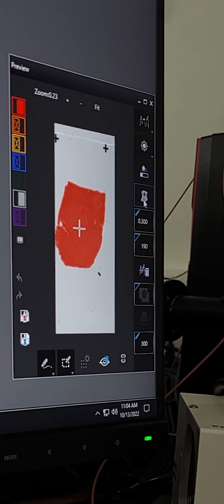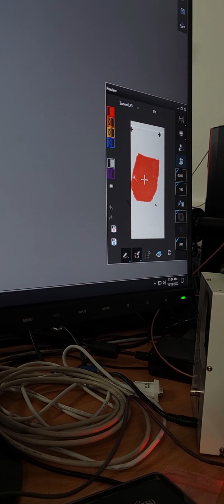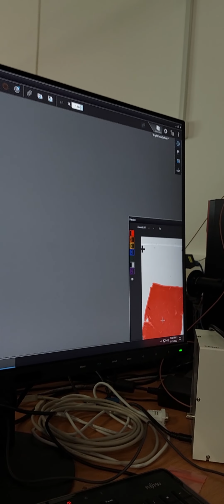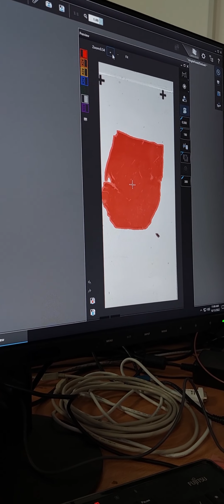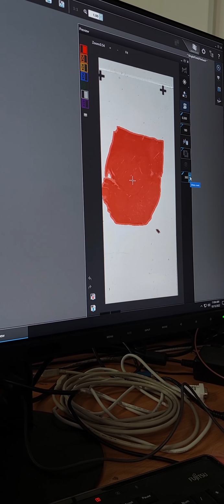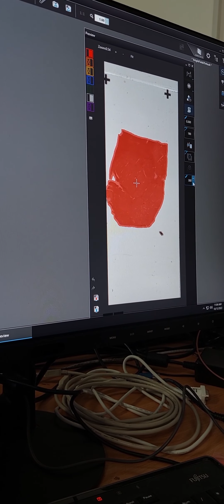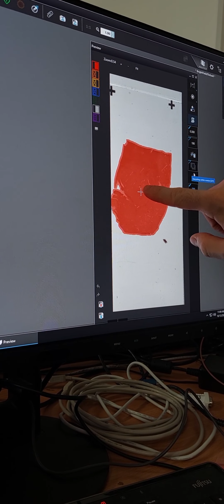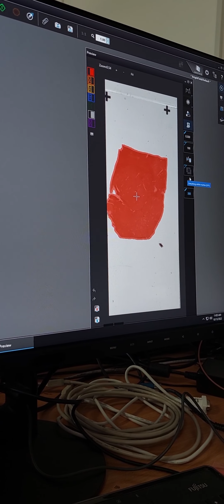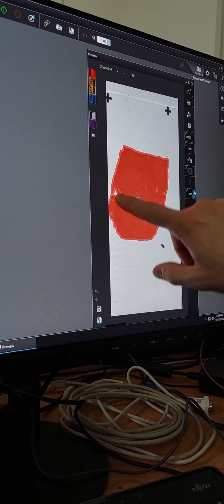It is always good to turn on fill holes in scan map. We will see the function of this very well. I think I won't be able to show you, but if there would be a hole here, for example, and I click on this, oh wait, yeah, there is a hole here.